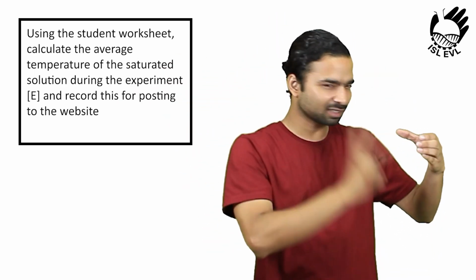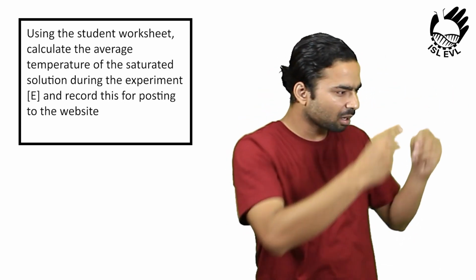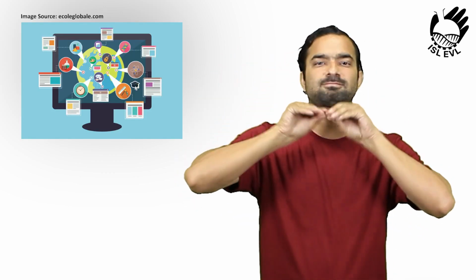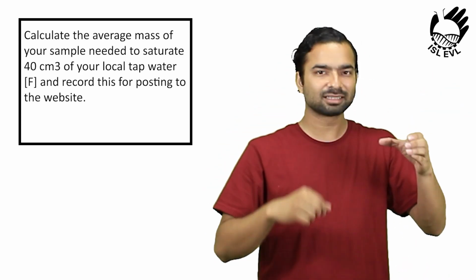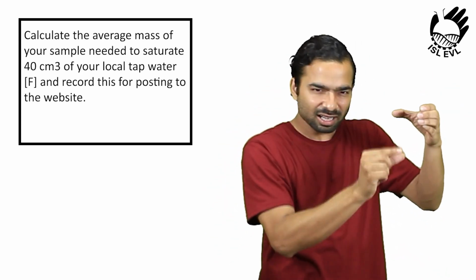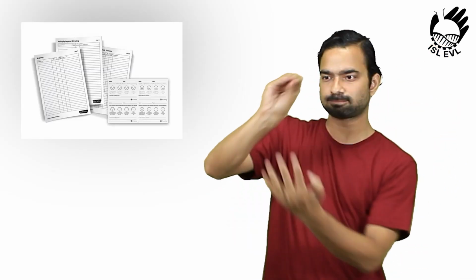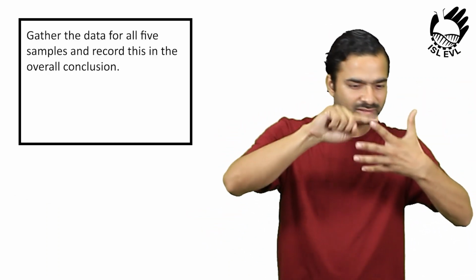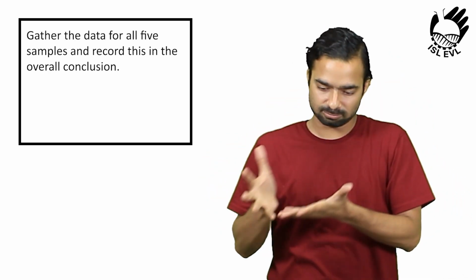Calculate the average temperature of the saturated solution during the experiment. Record in the table E and record this for posting to the website. Calculate the average mass of our sample needed to saturate 40 cm³ of our local tap water. Record in the table F and record this for posting to the website. Gather the data for all 5 samples and record these in a tabular format, as you can see on the screen, to reach the overall conclusion.